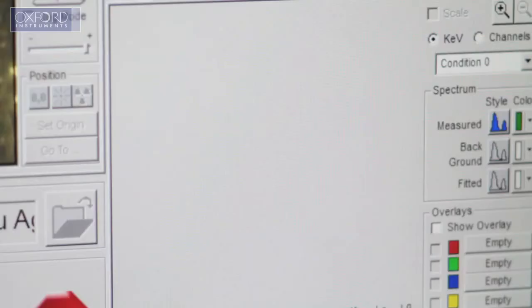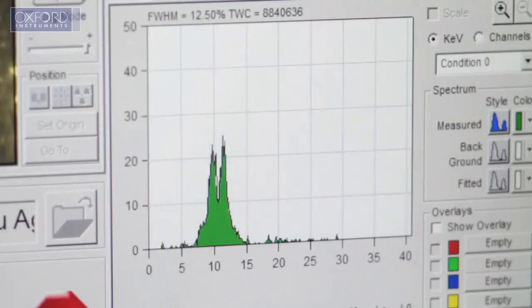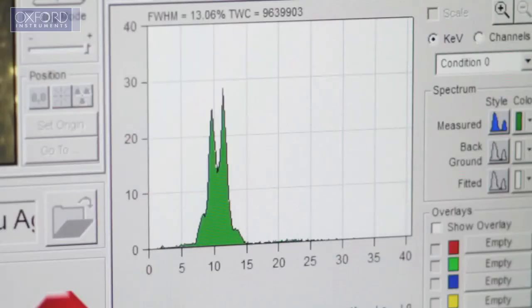When the analyses are complete, the analysis results appear on the screen, often in seconds.